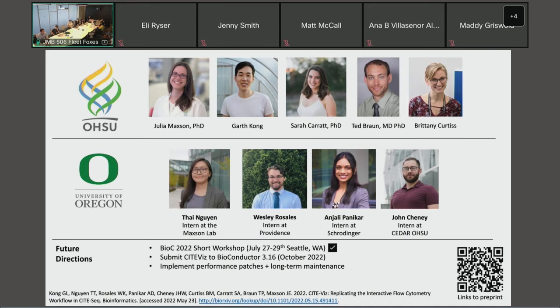I was fortunate to work with a really fantastic team of scientists. The team at OHSU really defined their need for a certain tool that can help them explore their data faster, and they really articulated what they needed. And the University of Oregon team were the people who really took their requests and implemented them into the package that is CITE-Viz today.